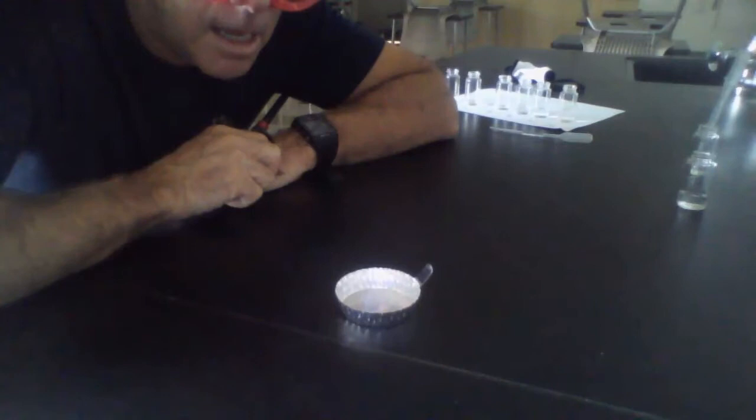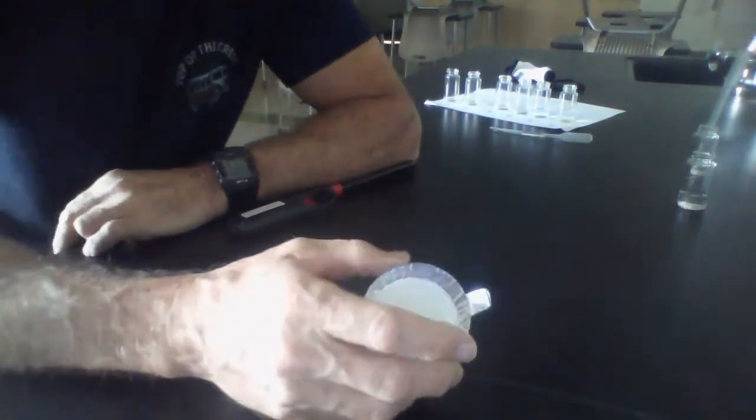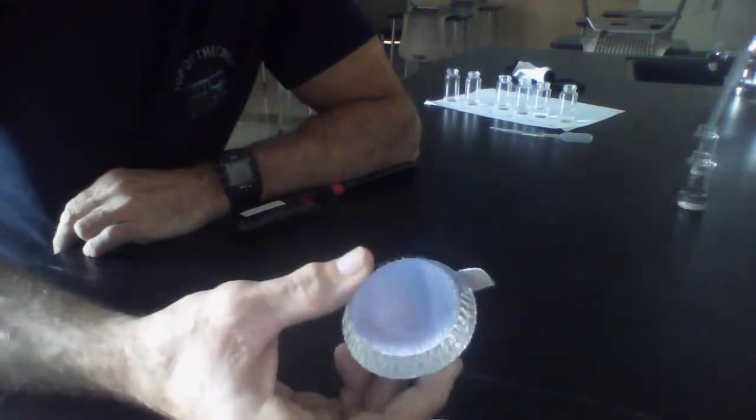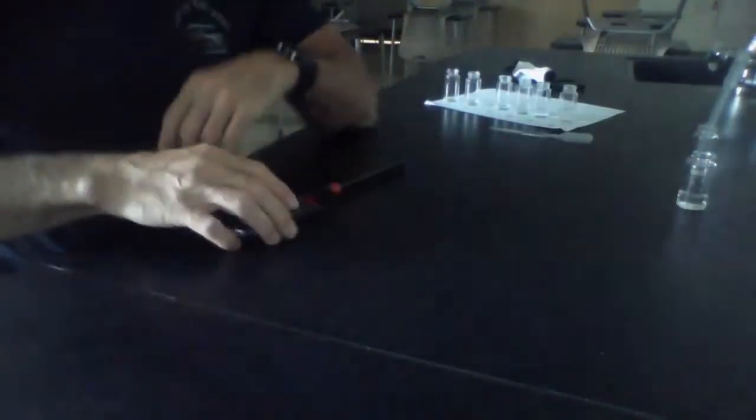Done. Okay, I hope you could time that. And I do see a slight residue, but certainly not as much as before. It's almost just an outline in there. And that was ethanol with an E.